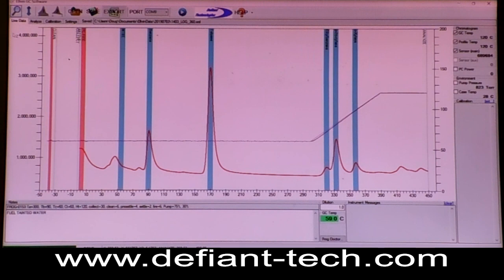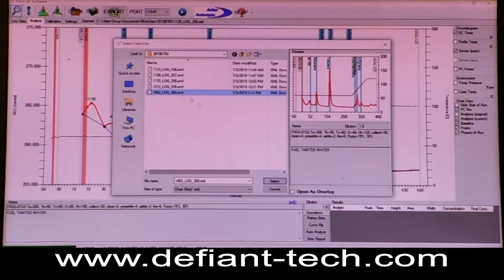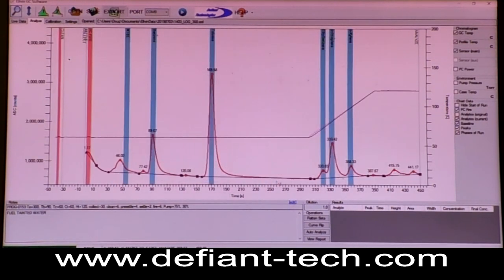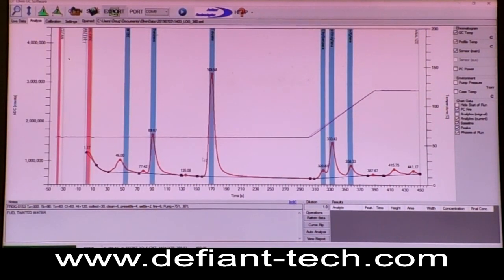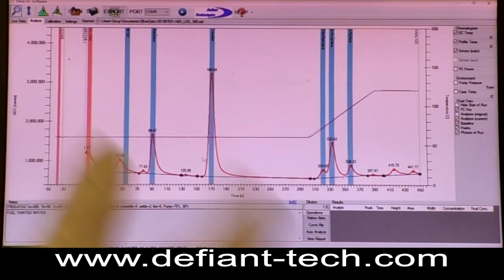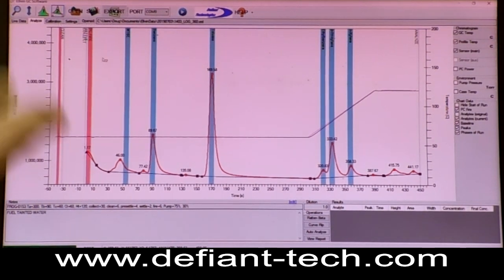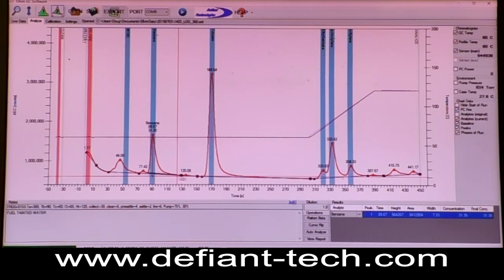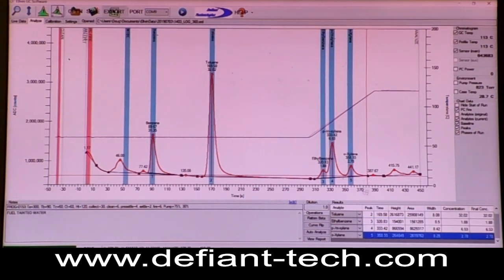Okay, the system just completed the run, so I'm going to open up the chromatogram it created. I'll come down here and choose the one and bring it up. You see the blue stripes — that's where the different chemical compounds it was calibrated for show up. I'll integrate the thing real quick. You can auto integrate or you can do it by hand. I'll grab that one, and this one, and then these, and I'll say view report.